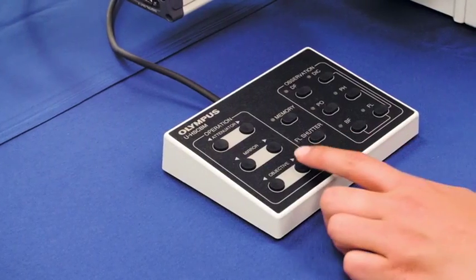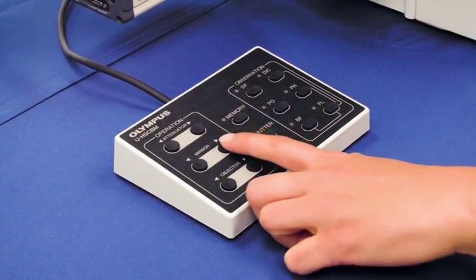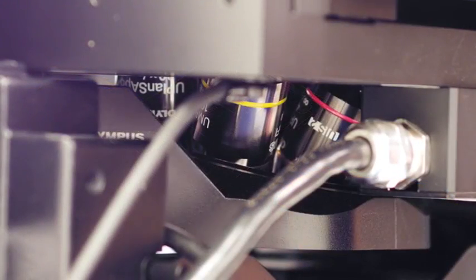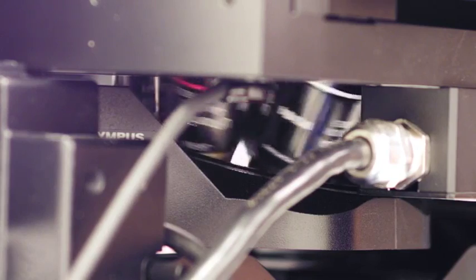The IX-73 Touchpad for motorized components allows easy adjustment of magnification, fluorescence filter cubes, and condenser elements, as well as the ability to recall observation methods.